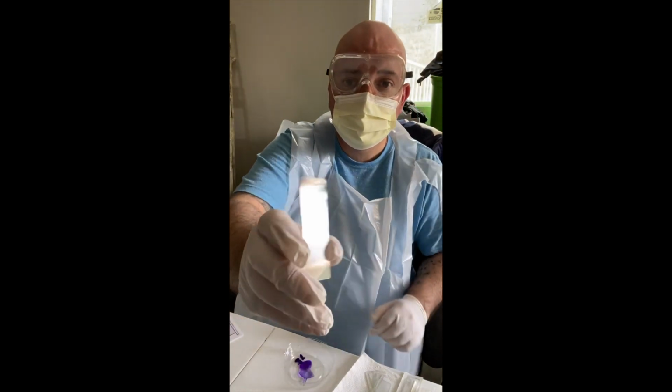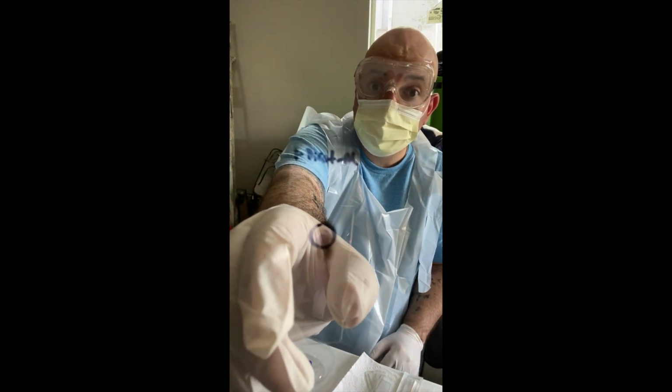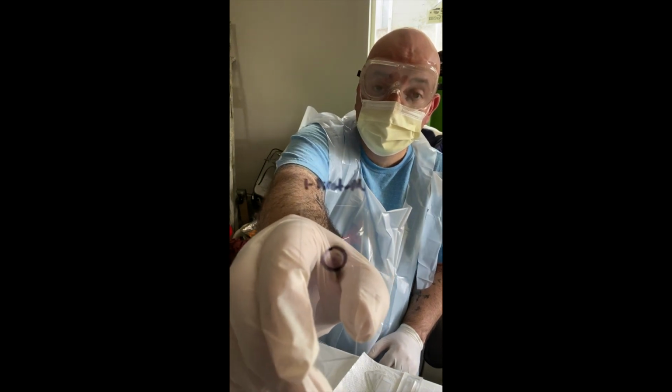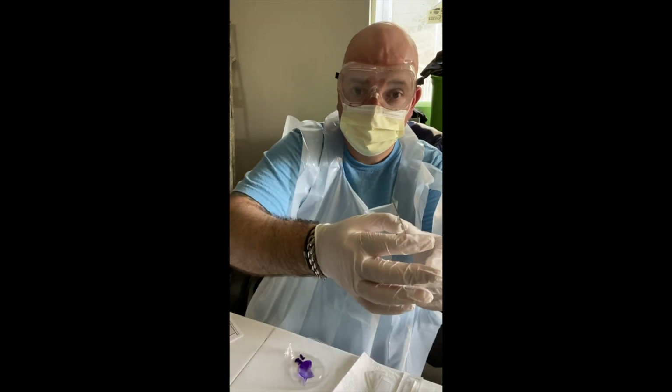Alright, so at this point with this first direct sample mouth slide, I'm going to take some pictures and upload it to my final report, and then we'll move on with the next slide and the next sample.